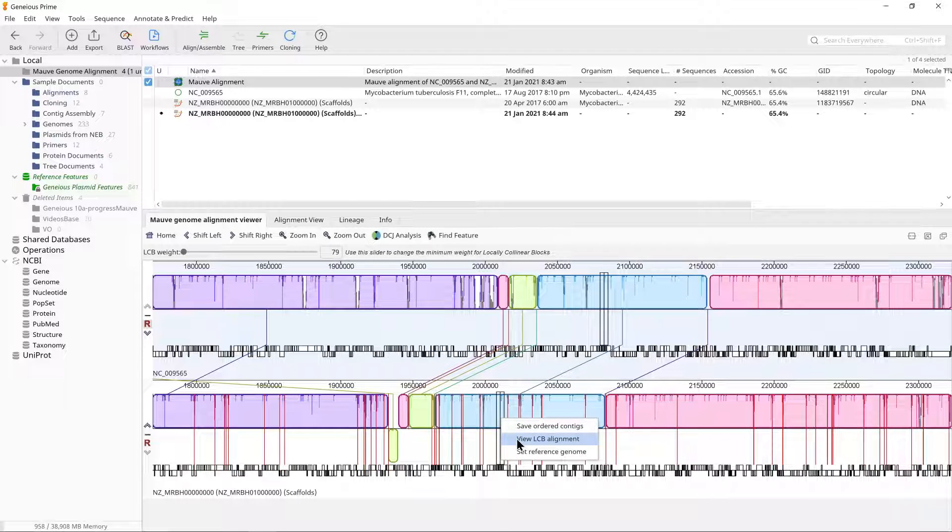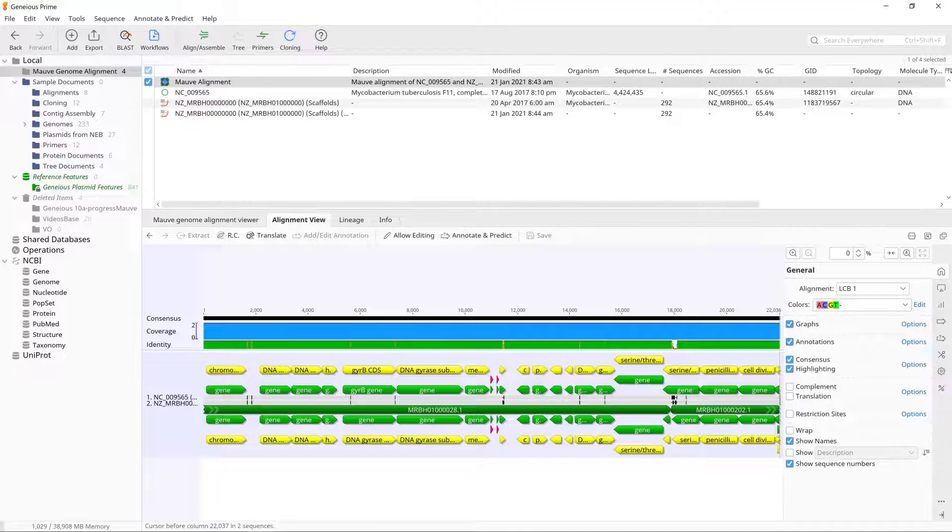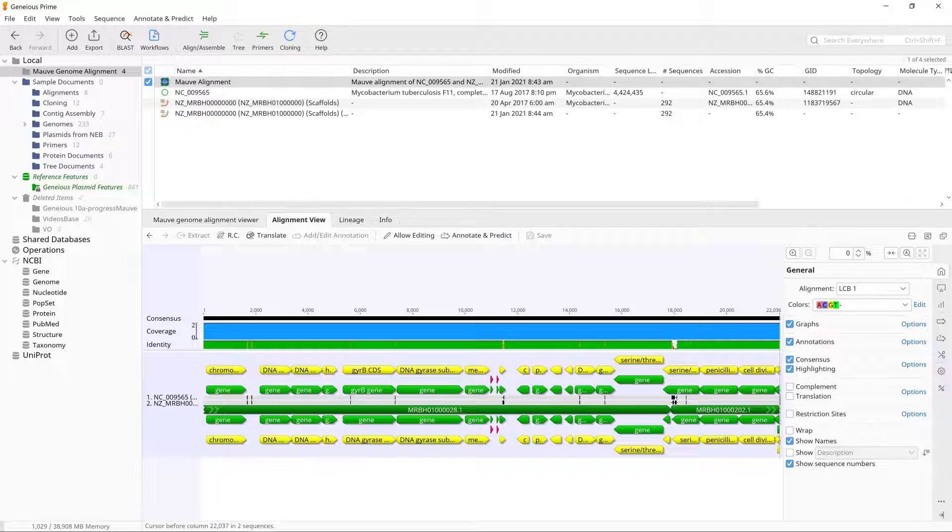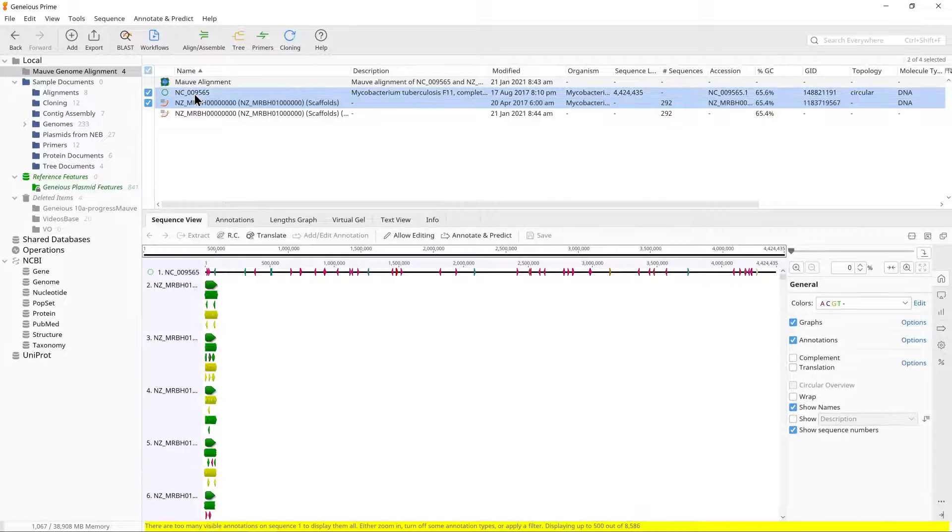Right click on the block and choose view LCB alignment. In the alignment view, you can see that the sequence is comprised of 35 concatenated contigs from the draft genome. Individual contigs are denoted by the accession annotation in green.